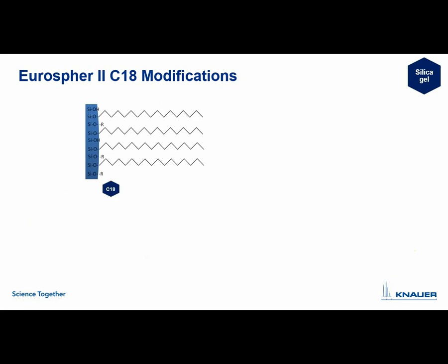But talking a little bit more about when these columns are used, I brought for you some examples. A classical C18 column can be used for a lot of analysis. So it's really widespread on the market, and we analyzed, for example, this molecule, very well-known penicillin. It is kind of polar, kind of unpolar, has different places and can be analyzed perfectly on C18. This is also caused by the fact that it is soluble in mixtures of water and acetonitrile, for example.